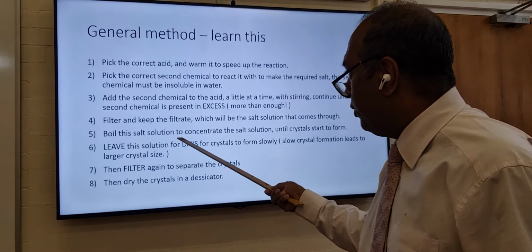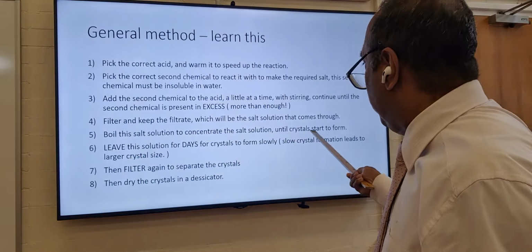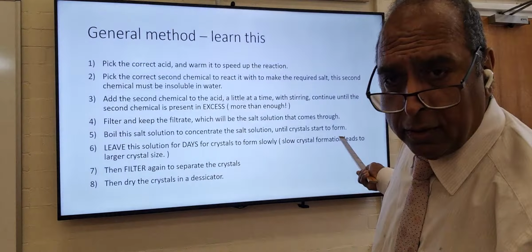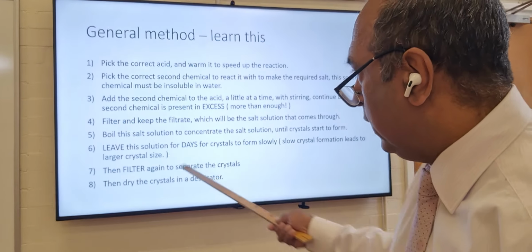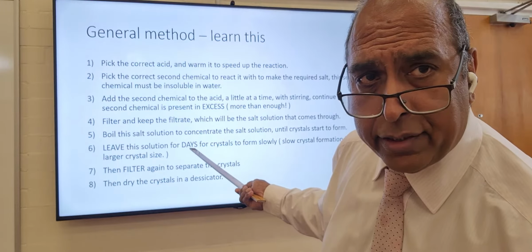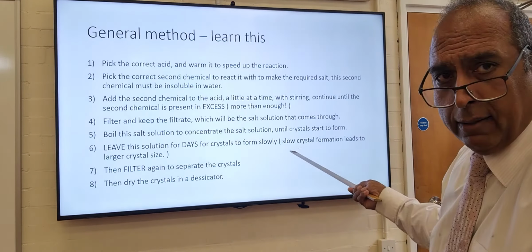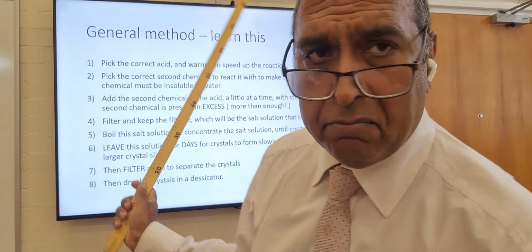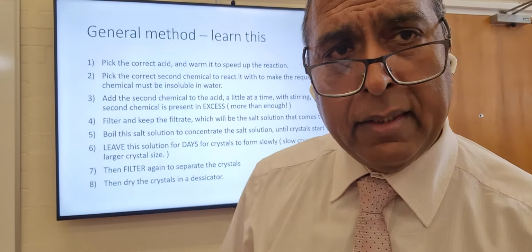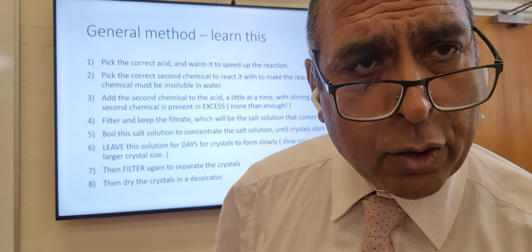Boil the salt solution to concentrate it, which is what I just showed you, until crystals start to form. And that's crystallization. Leave that solution for days for crystals to form slowly. After 2 or 3 days, normally I leave it over a weekend, and then we get back to the next lesson after the weekend.